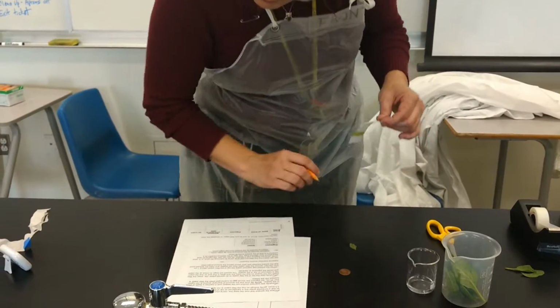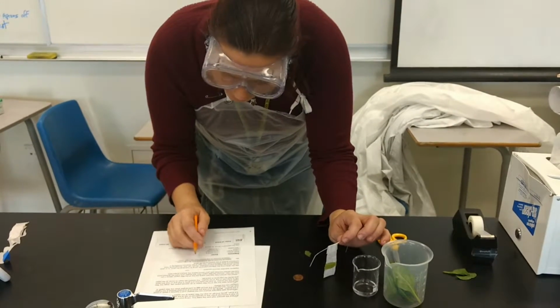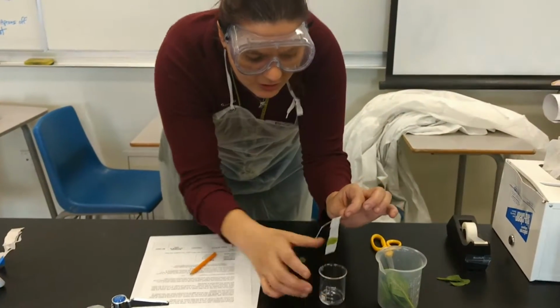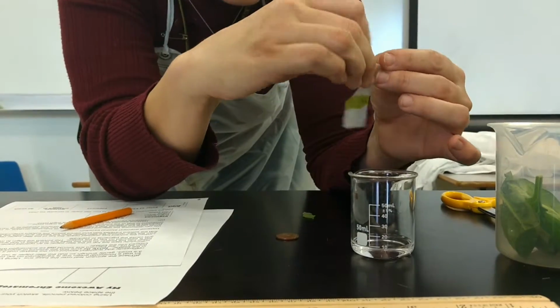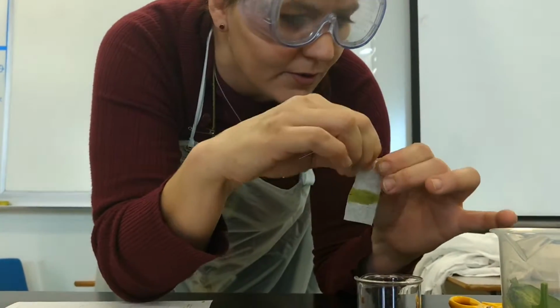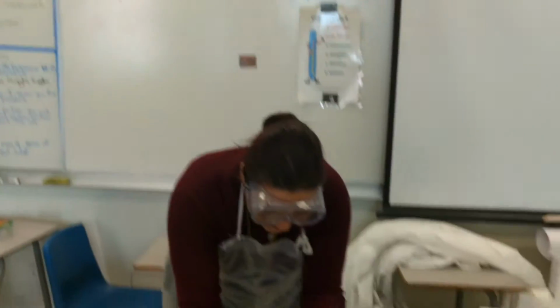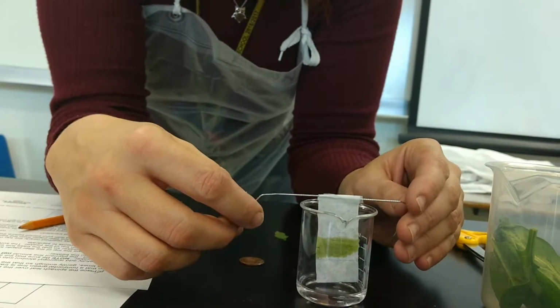Because the filter will go up, it's very important that we do double check and make sure. We're not pushing the filter into the solution, we're just setting it carefully on it. Now, what we're going to do is place the filter into the solution. Okay, I'm still not comfortable with this, so what I'm going to do is roll up the filter paper just a little bit more because we don't want the pencil line in the solution. So, will someone tell me where we want to keep the pencil line away from? Very good. All right, I'm going to go ahead. There we go. Turn it around so you can see it. Now I want to make sure that when I put it in, I don't put it in with the lip. The lip goes lower. And that actually affects.